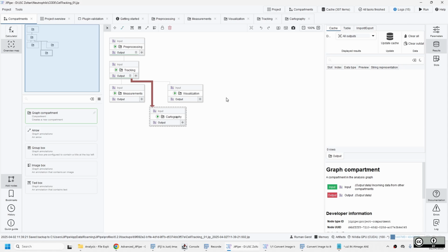You can play with the parameters, you can add additional steps, you can do whatever, because you understood how this works. If I gave you my original macro, you would be like, yeah, thank you, no. We don't want that. So I hope that you learned how to handle larger projects, how to really grasp the power of JIPipe. It is complex, yes, especially with the annotation system. It's not trivial, but once you jump over that hurdle, you should be fine.